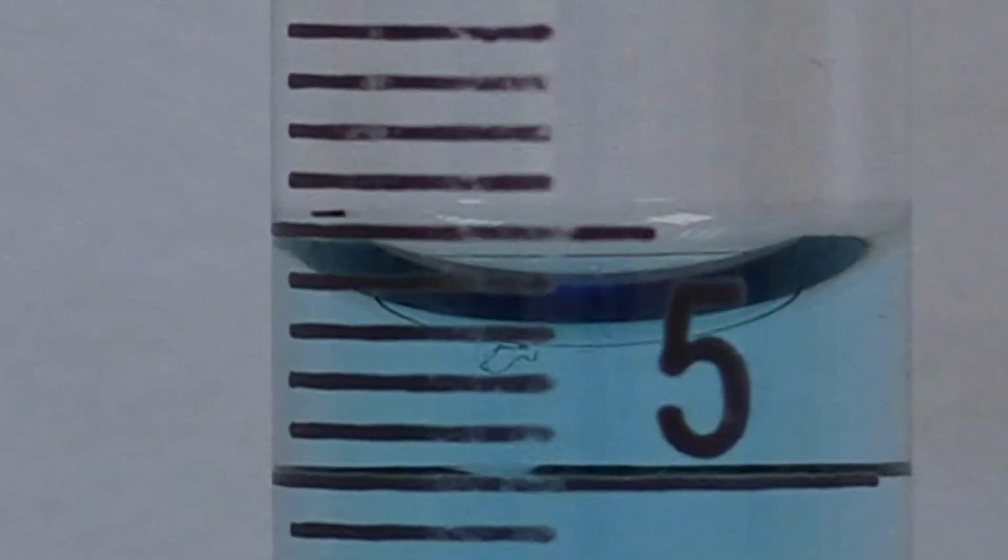Like our graduated cylinder, we're going to zoom in with our mind's eye and further divide the space between two graduations into 10 parts. For this burette, each graduation is 0.1. We divide each of those 0.1 graduations into 10 parts, making each of those 10 parts 0.01. This means that our burette can be read to the hundredths place. Reading from the top down, we see our reading would be 4.69.